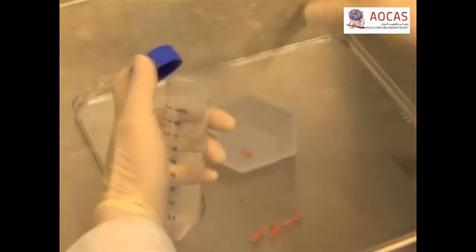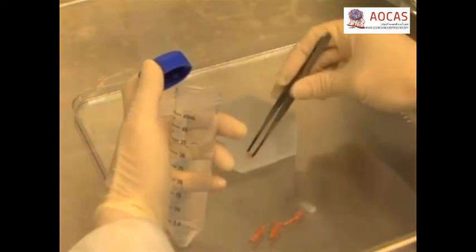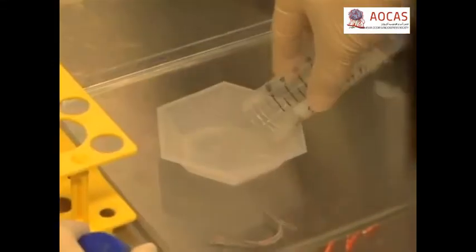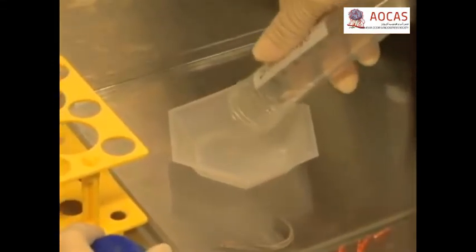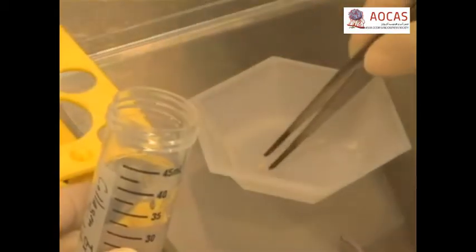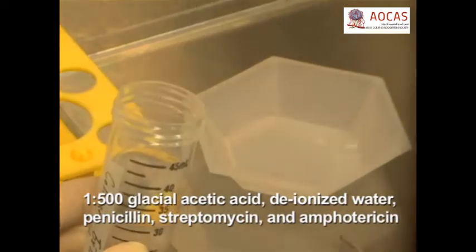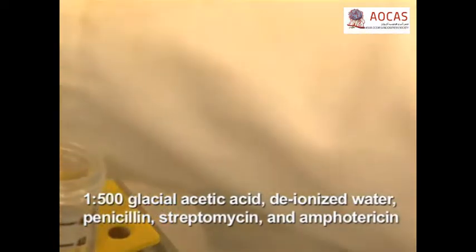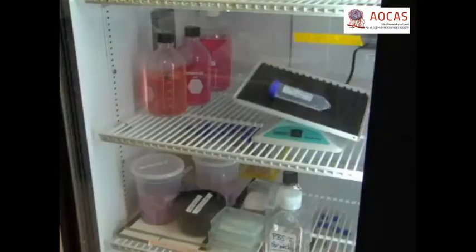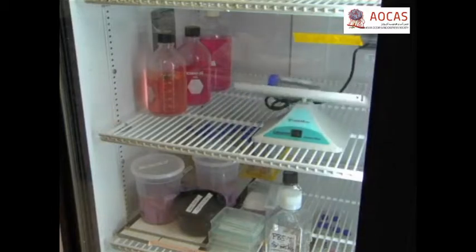Transfer the tendon fibers to a sterile container and wash with sterile distilled water, then aspirate off most of the volume. Pour the remaining water containing the fibers into a weigh boat, then transfer them to a 50 milliliter conical tube containing 35 milliliters of glacial acetic acid, diluted 1 to 500 in sterile deionized water, with penicillin, streptomycin, and amphotericin. Place them on a rocker at 4 degrees Celsius for one week to extract the collagen.